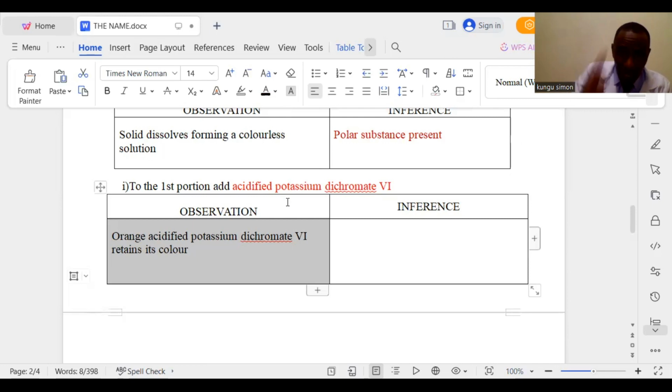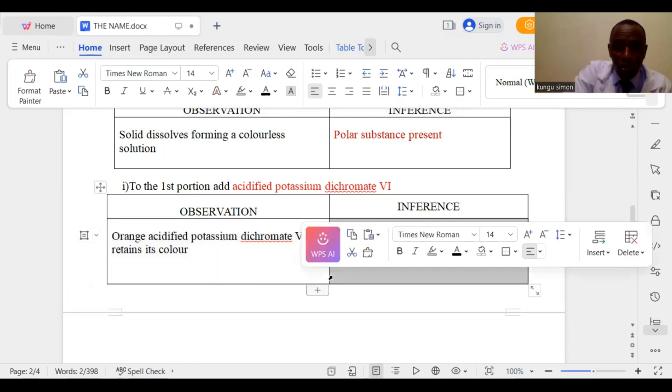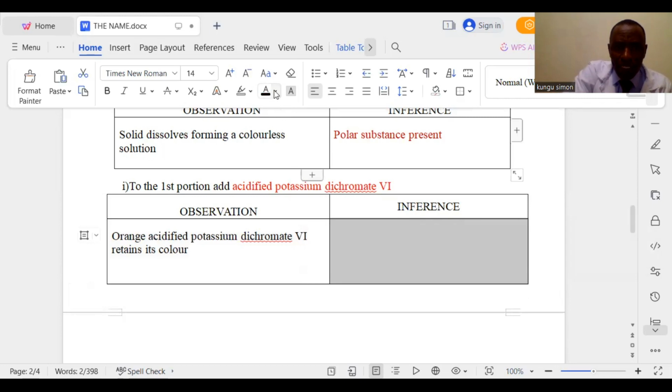It is either present or absent, and maybe you can tell by now, from what we've just observed, that indeed the ROH is absent. Look at that. The ROH is absent. That's what we're talking about. Now, very fast, we get to the other.